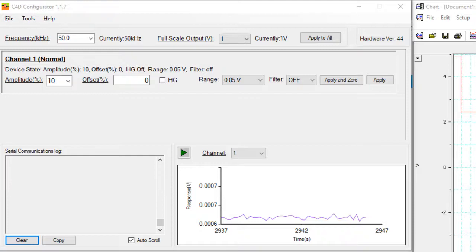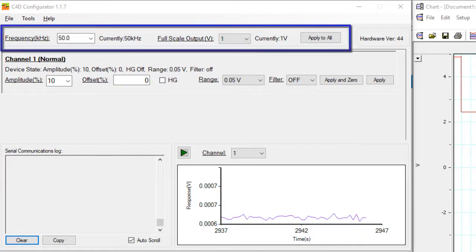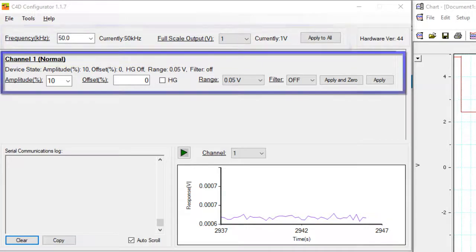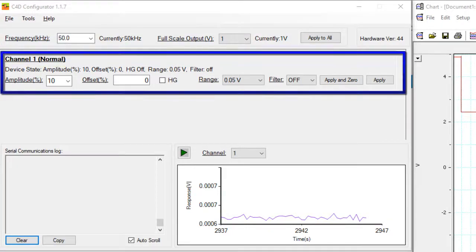If you have a multiple channel ER825 connected, the top part will let you set the frequency on all of the channels, and the middle part will let you set the amplitude, head stage gain, and offset on each individual channel.